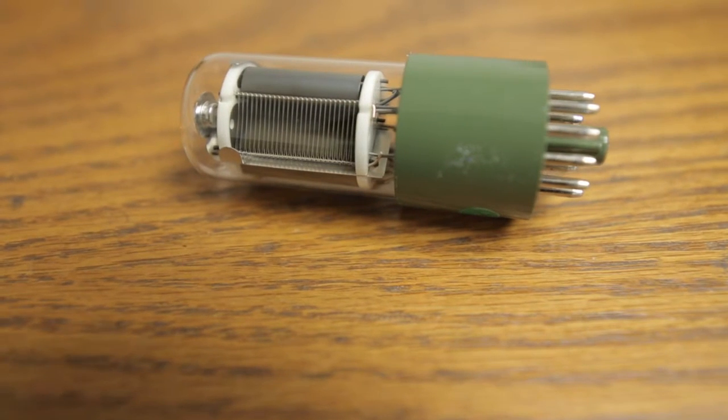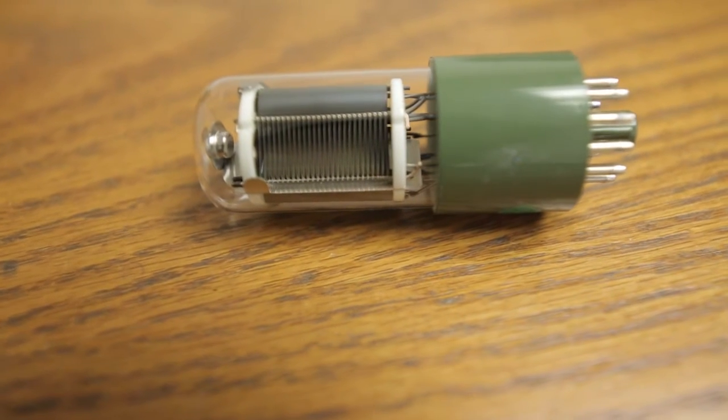The sample which is now emitting phosphorescence or fluorescent signals in all directions, that light is collected down a detection channel and the emitted light is also passing through another 250 millimeter focal length monochromator and from that monochromator the light is delivered to our unique analog detection PMT. All Quattro spectrofluorometers use a red enhanced PMT that has detection from about 185 to 900 nanometers.